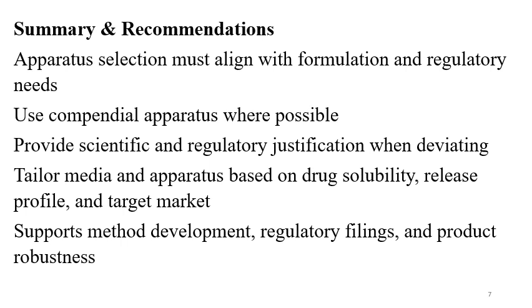The dissolution apparatus is to be selected considering the formulation design and the release profile. Apparatus selection must align with the formulation and the regulatory needs. Generally, as per my experience, apparatus 2 paddle is used 90% of the time for the IR formulations. Some of the ER formulations utilize basket apparatus, and capsule formulations are generally tested in the basket apparatus.